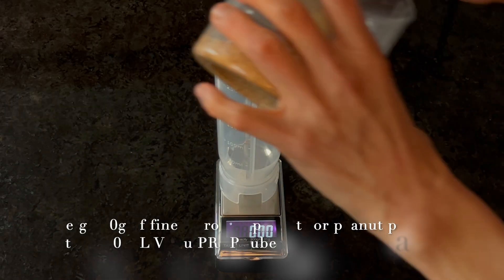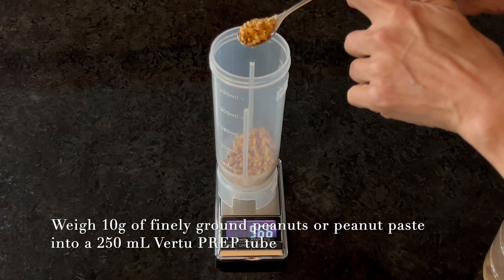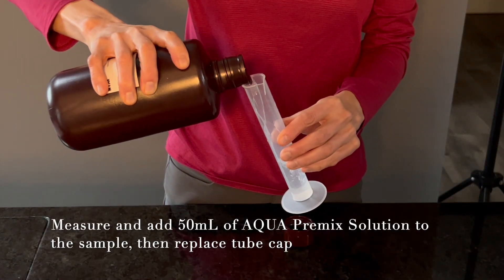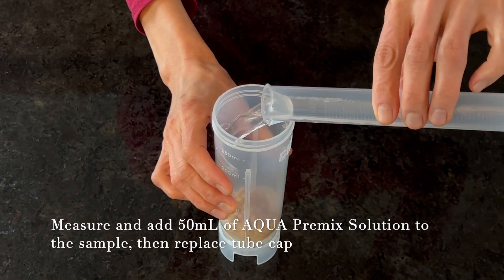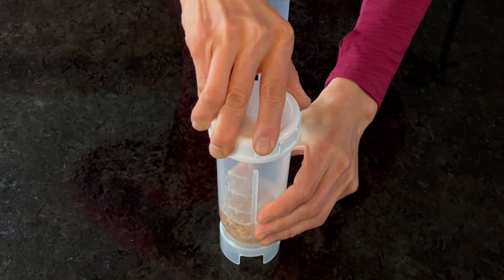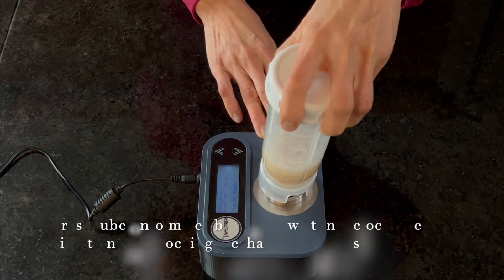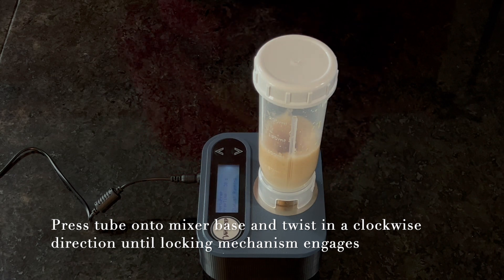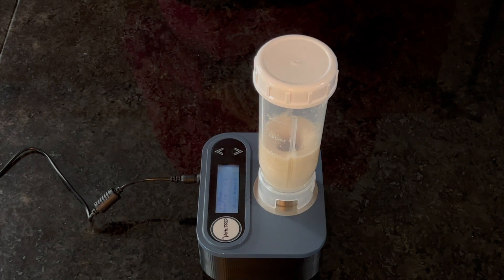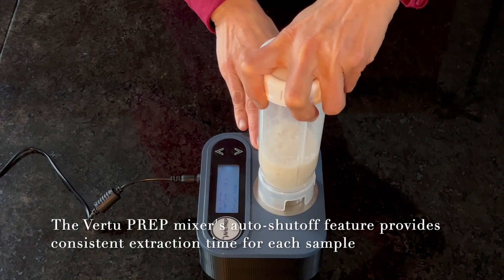To extract aflatoxins, weigh 10 grams of finely ground peanuts or peanut paste into the 250-milliliter VertuPREP Extraction Tube. Add 50 milliliters of Aqua premix to the sample in the tube and replace the cap. Invert the tube or shake briefly to wet the sample, then twist in a clockwise direction until the locking mechanism engages. Once the tube is in place, mixing begins automatically. The auto shutoff feature enables walk-away automation resulting in precise and reproducible extraction.